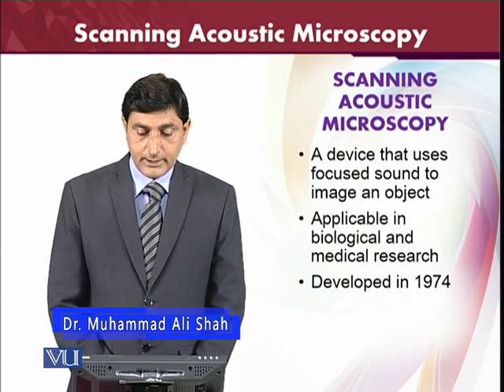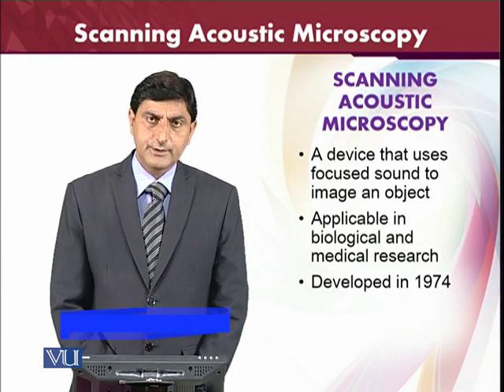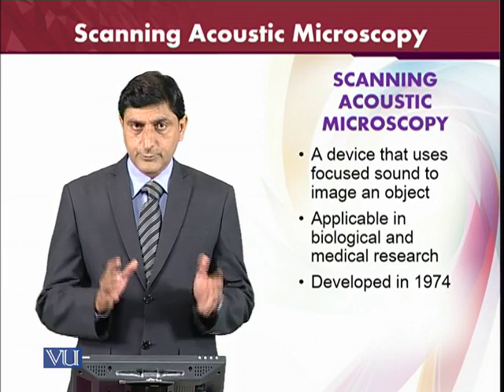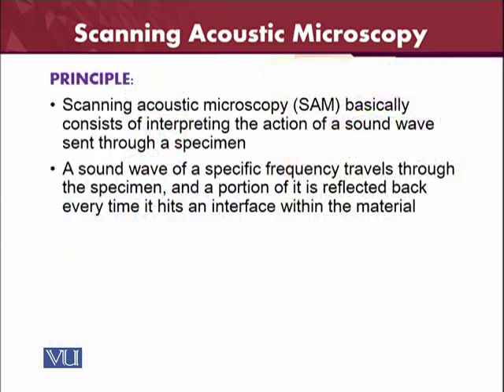Applicable in biological and medical research, it was developed in 1974 for the first time to use sound, the focused sound, to see an object. The sound waves make it possible to see the objects.